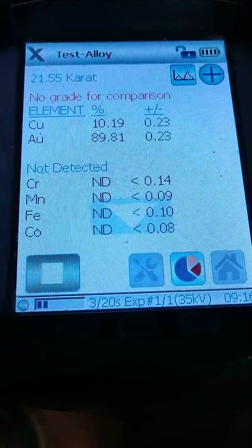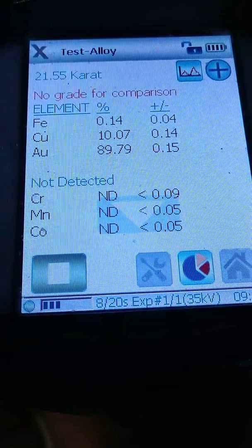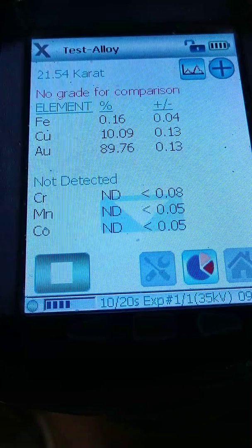We see that one is coming up right at 10% copper and 90% gold. So we know that one is decent — nothing wrong with that coin there. That's our first coin.